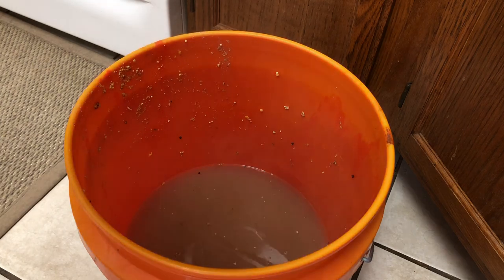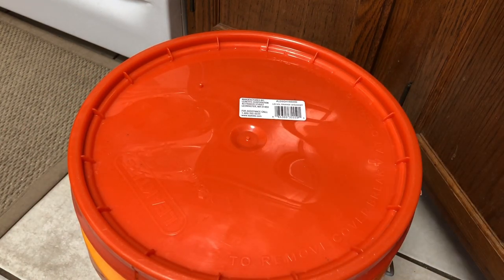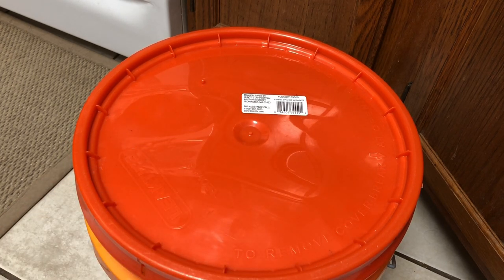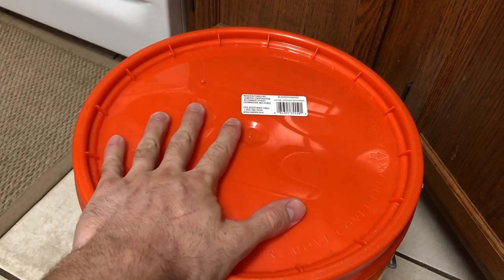Now that all of our sunflower seeds are out of there, we're just going to pop a lid on this. We're going to let it sit for about 2 hours. You can go as little as 1 hour. This is the soak step. You can't skip this. You can do 1 hour, but there's a possibility that if you have slow colonizing jars, they could stall from not having enough water, not being hydrated well enough. I do 2 hours, never had a problem. You can go up to 10 hours without an issue. You just don't want to leave it for really more than 10 plus hours. Some of the stuff will start to get a little mushy and weird. So we're gonna let this sit and then we'll come back.